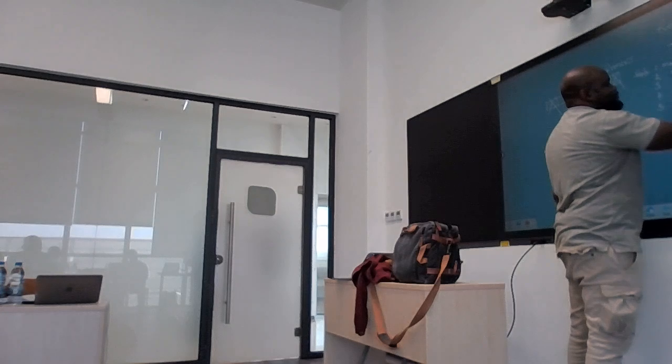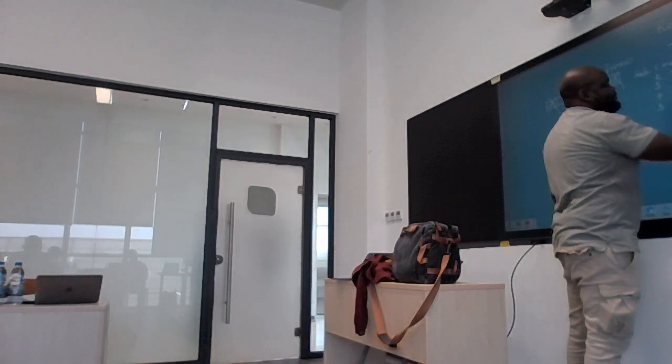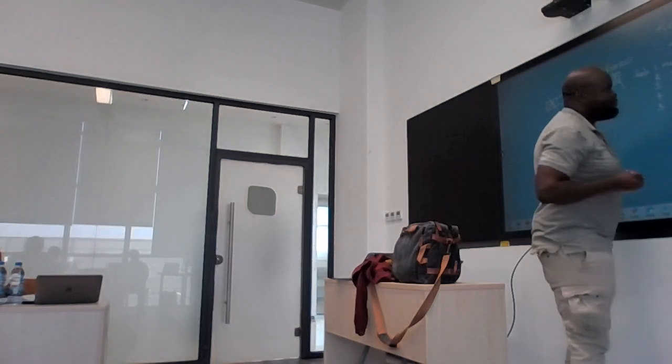Could even say this goes to 29. This goes to 40. Okay? So we trim primers, and this one, after removing the primers, the quality goes up a bit. This one, the quality goes down. This one goes up. So now, again, this is lower than 30. We remove that. Okay? Now there is the last step where you want to trim the read. So there are two things.